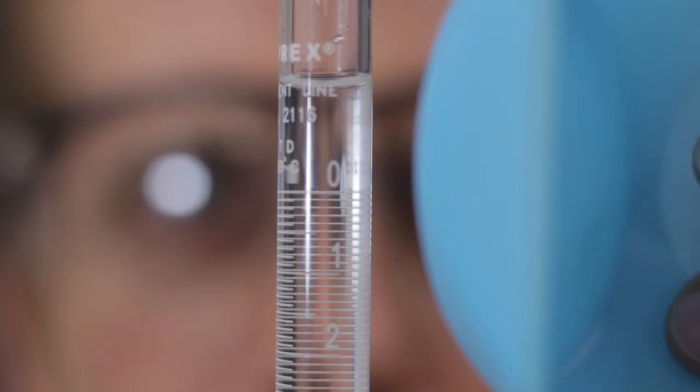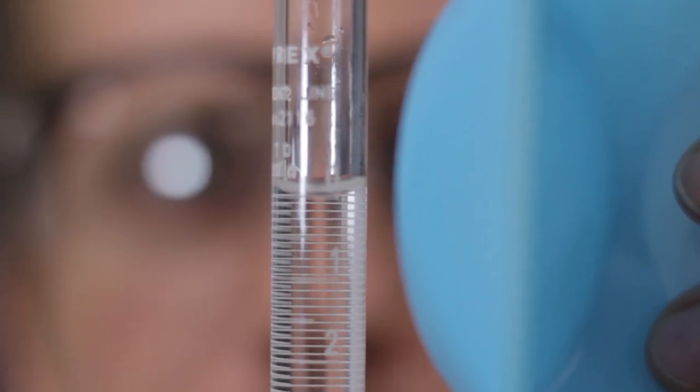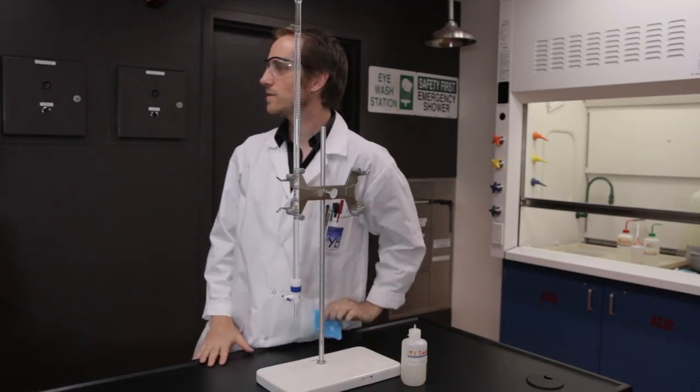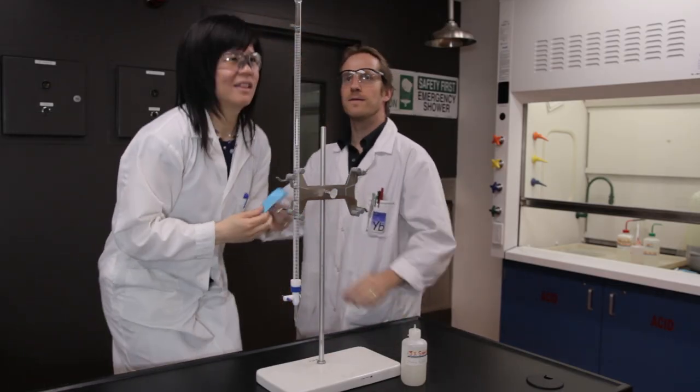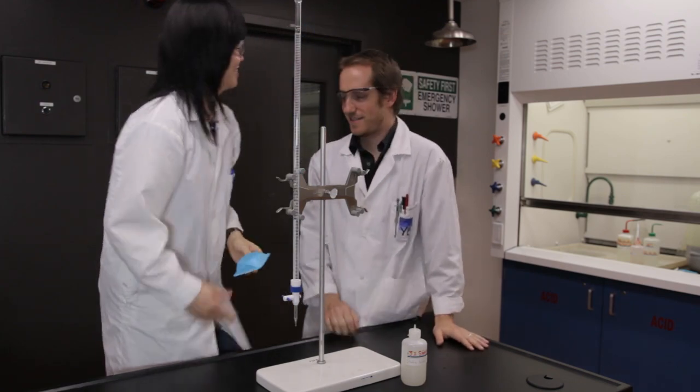Drain the burette so that the bottom of the meniscus is at the zero mark. Be sure to read the meniscus at eye level. Record the initial reading of the burette to two decimal places. The reading should be based on the bottom of the meniscus.